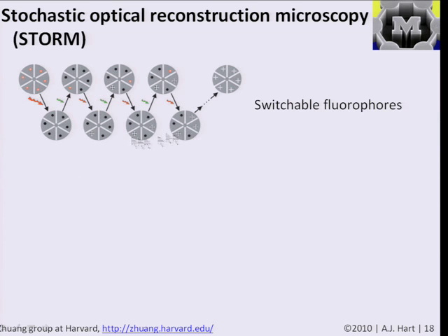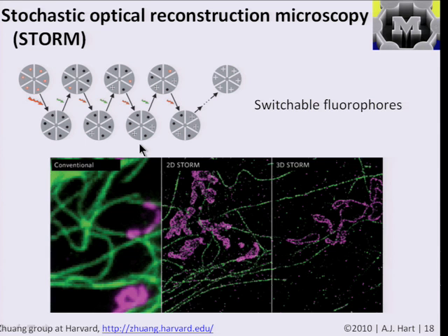And what I didn't say just a second ago is if you do that in different areas of the tissue, or hit it with that red light, so you only turn on a part of the emitting molecules at a time, you can basically take several pictures where the distance between your light bulbs is bigger than the diffraction limit, but if it's all stable, you can then overlap those images and you can get a picture that's way beneath the original limitation of the system. So it's worked incredibly well, and this has really enabled a lot of interesting observations and discoveries.